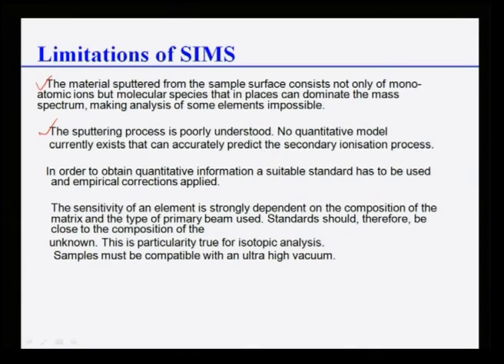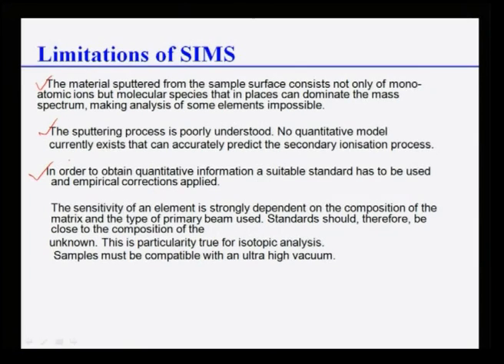The third thing is that in order to obtain quantitative information, you have to have a suitable standard. That is the case for everything, in SEM also, EDS also requires a standard. Another thing is that the sensitivity of an element is strongly dependent on the composition of the matrix. Remember, you are putting the element in a matrix, organic matrix, liquid matrix, so it depends on the matrix. We have shown that even the intensity is a function of the matrix, it is not linear with only the element present. And also the type of primary beam used. Standards should therefore be close to the composition of the unknown. This is particularly true for isotopic analysis.